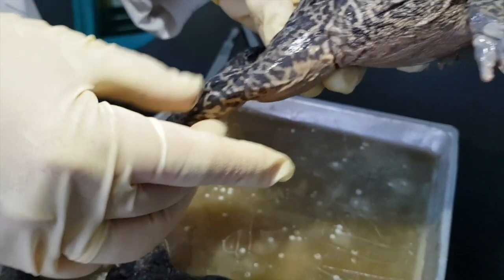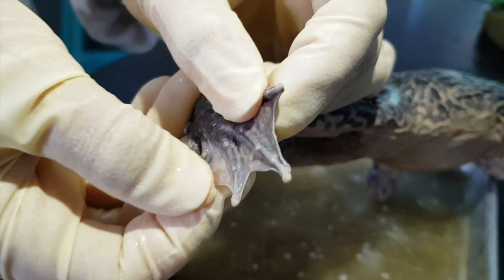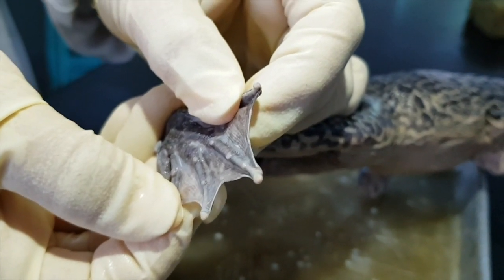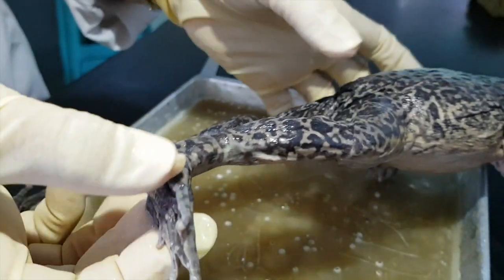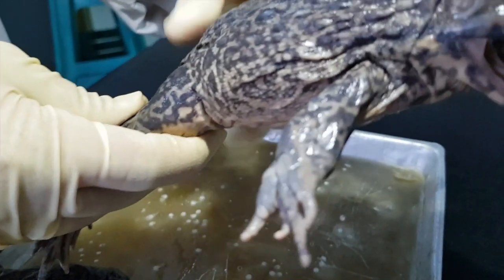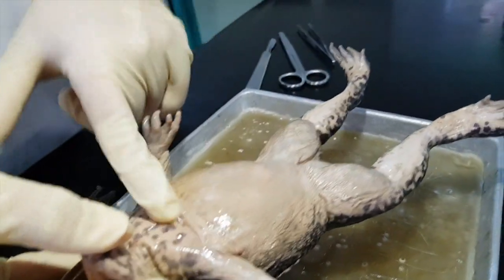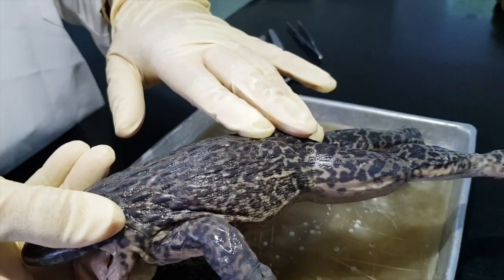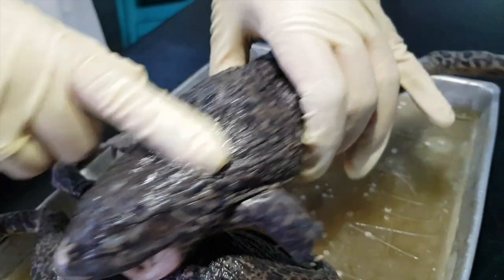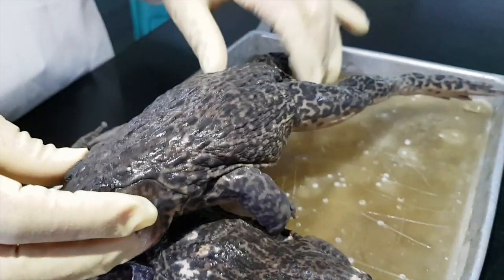The lower limbs are much longer, adapted for hopping for frogs. So the thigh, the shank, and the phalanges, which end in webs. The web is used by frogs for swimming if they are underwater. All of this, of course, is supported by the skeleton, by bone structure. On the ventral portion, you see that it's somewhat lightly colored as compared to the dorsal. And warty skin for most of these frogs. Some frogs have smooth skin.